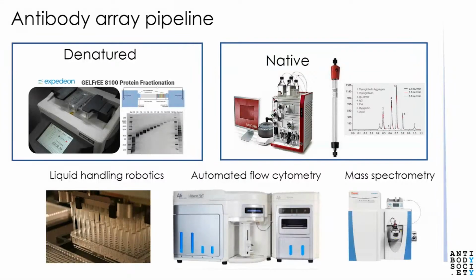So to summarize this, we think that antibody validation is a question of both precision and throughput. And with arrays, you can obtain very high throughput. But to really benefit from that, you need to separate proteins in samples. So you need Western blotting applications, or the native versions of it, which is a combination of subcellular fractionation and size exclusion chromatography. But if you combine very extensive protein separation and antibody array analysis, you can get very high resolution.